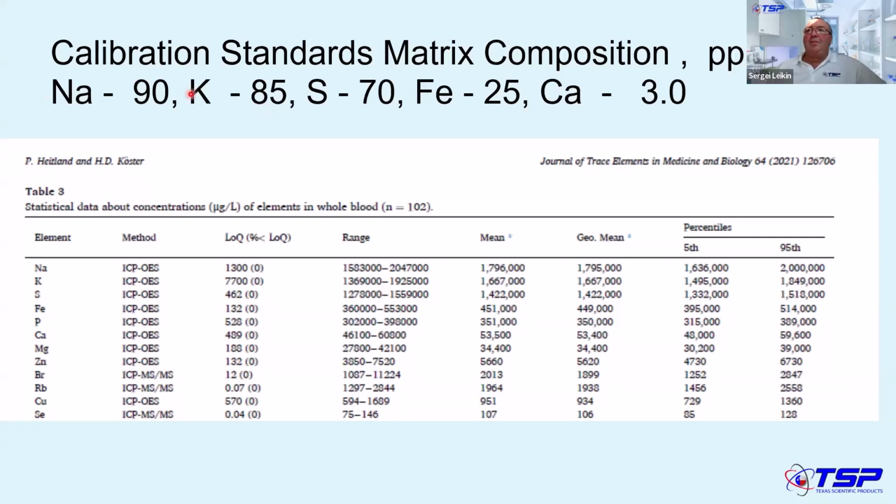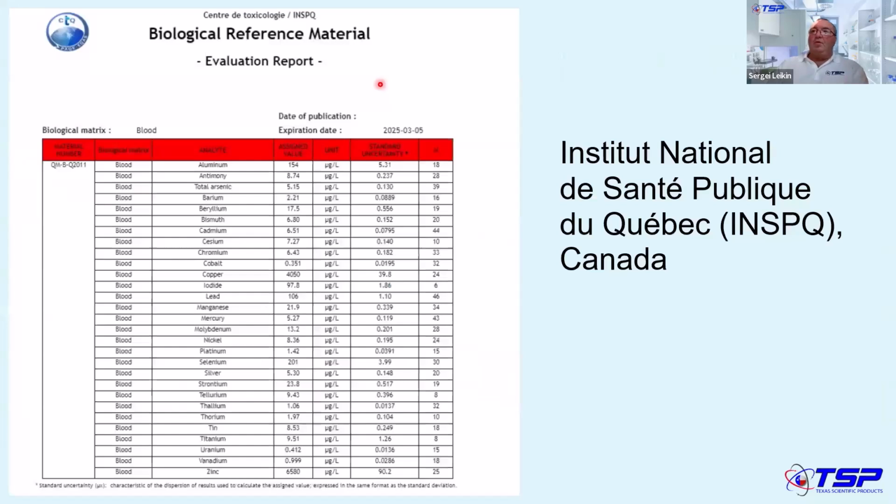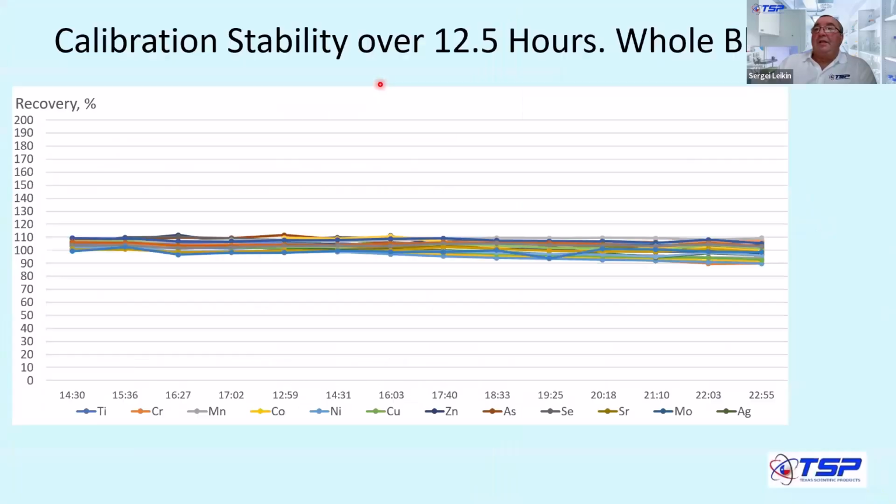And this is how we came up with a few elements for which we created a sort of synthetic calibration standard. So let's say 2,000 divided by 20, that's 100. We went a little bit lower, to be in the middle, closer to the high end of the range. That's how these matrix-matched standards were created. Then we took a reference material that was available and ran the analysis.